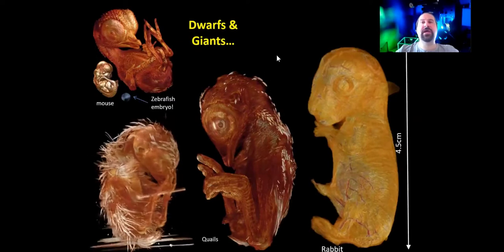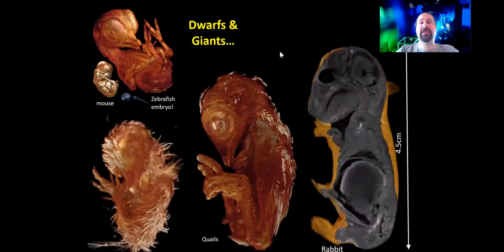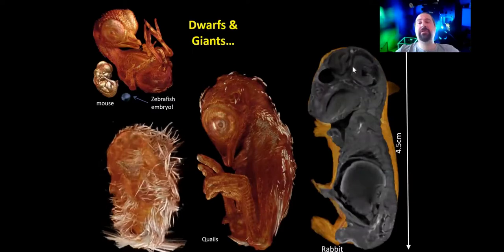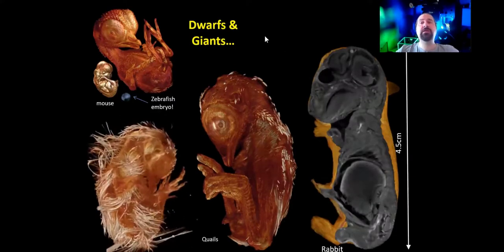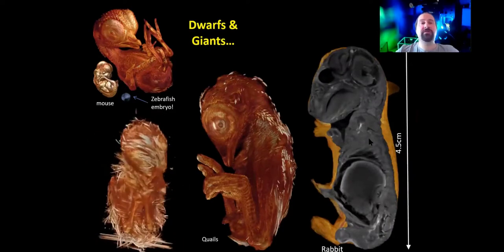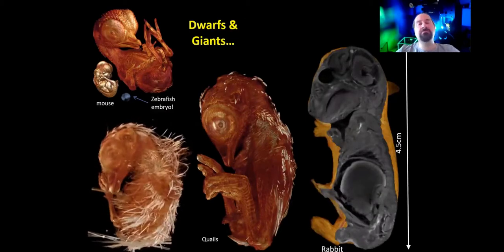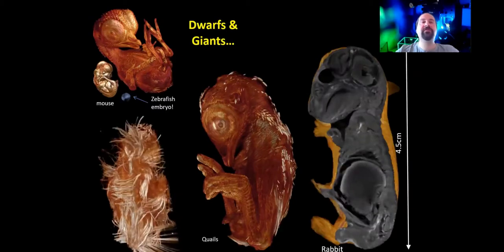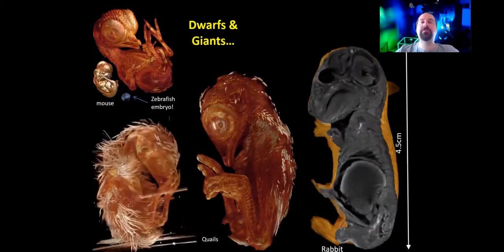Really interesting. Back then I had no idea that anyone had ever tried to image this. And again, keep in mind, this gives you all the anatomical information, all the detail inside this rabbit embryo as well. To obtain an image like this on a 2,000 euro OPT scanner takes about 1 hour. Probably even less than 1 hour these days with the graphical processing units, the GPUs that we have in most computers.